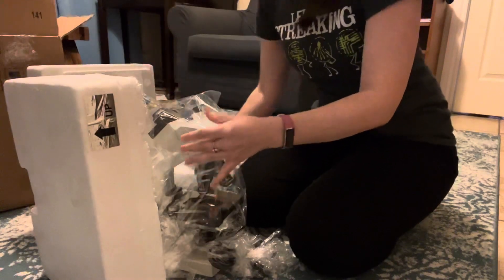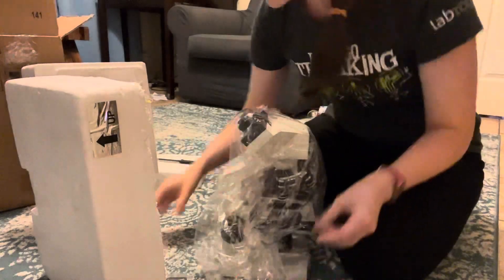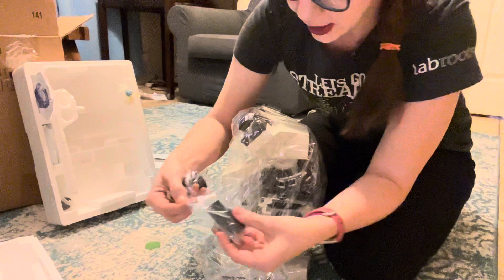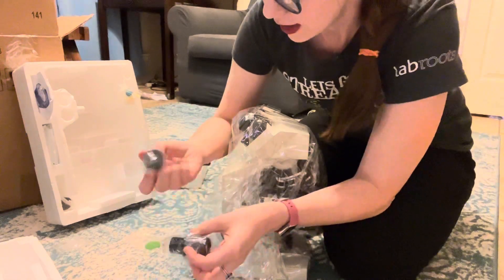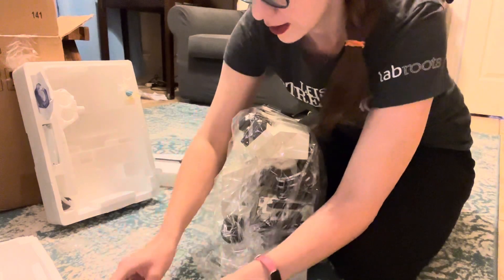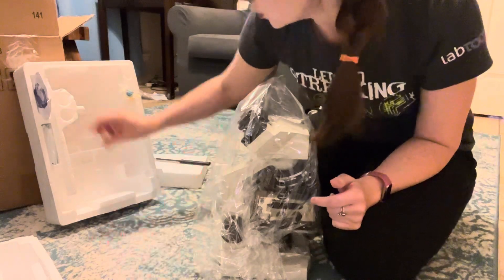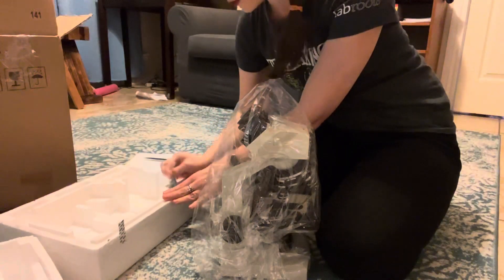Woo-hoo! So this is an Omax, and it is a 40 to 2,000 times microscope with a built-in camera so that I can do some YouTube streaming of whatever microbes I can come across.